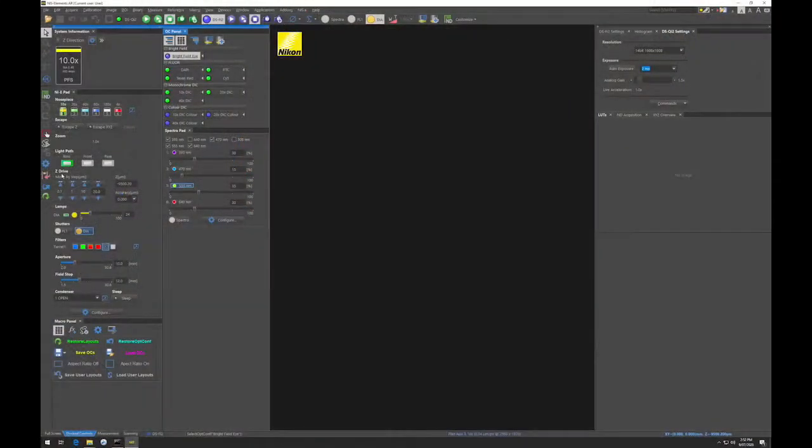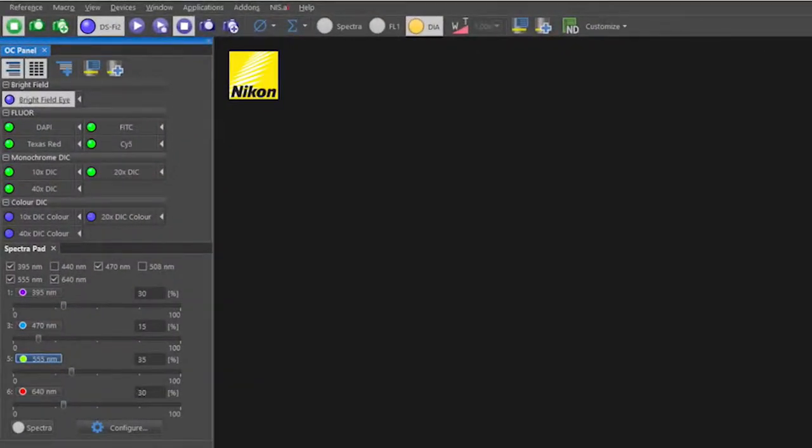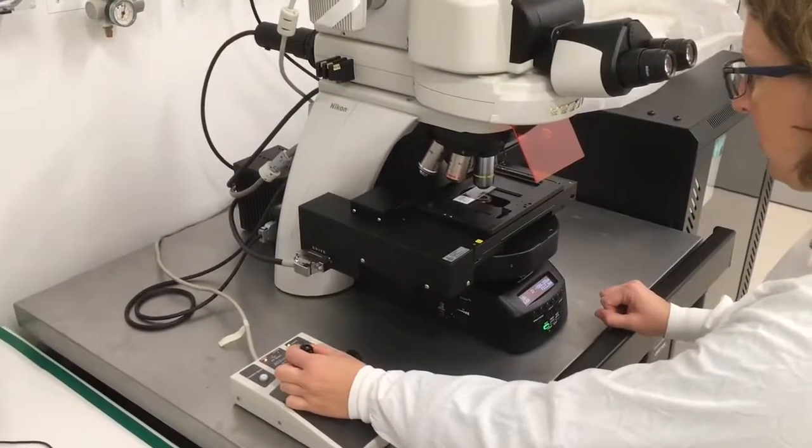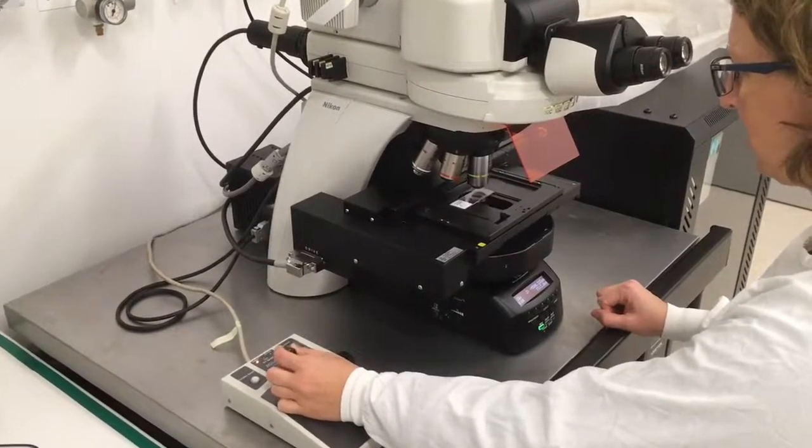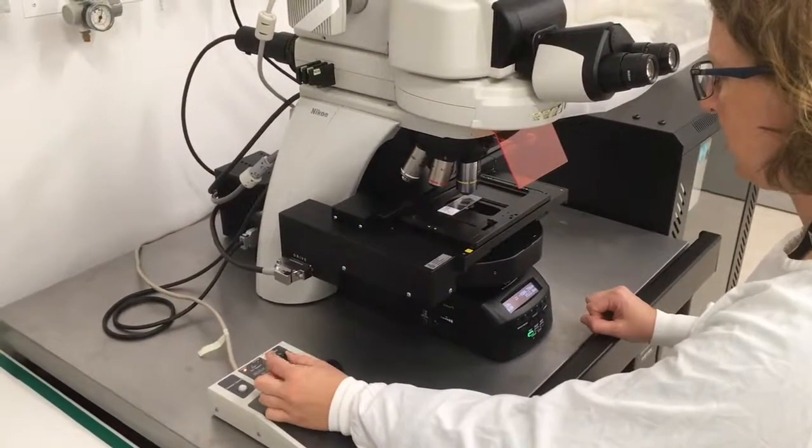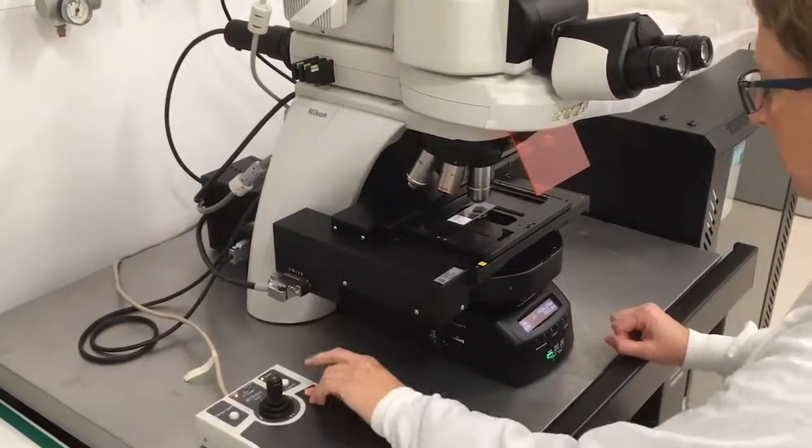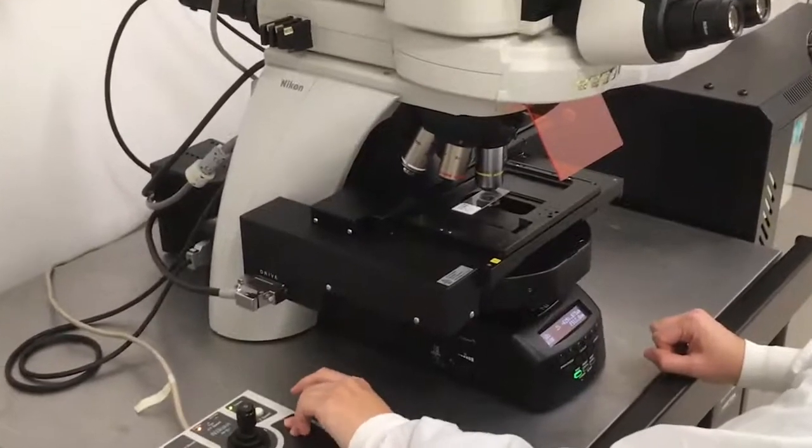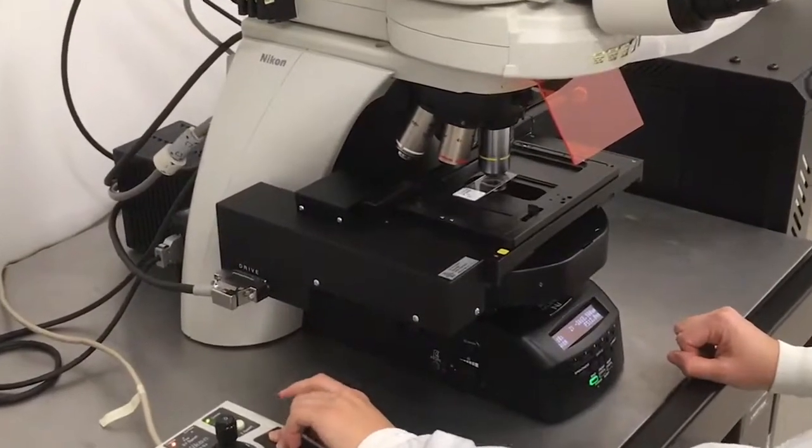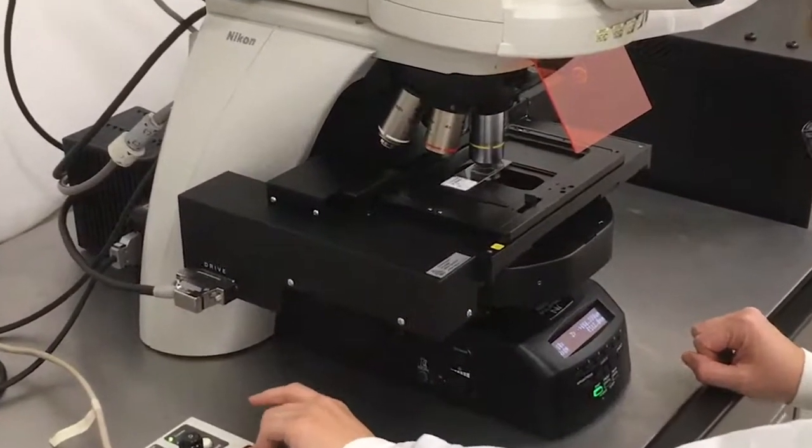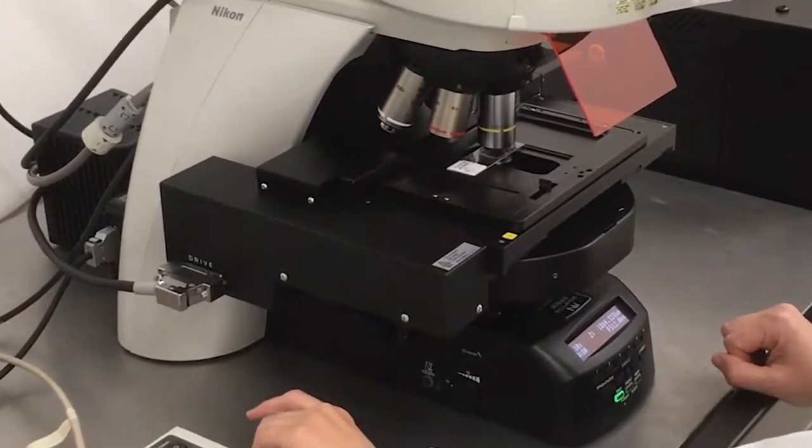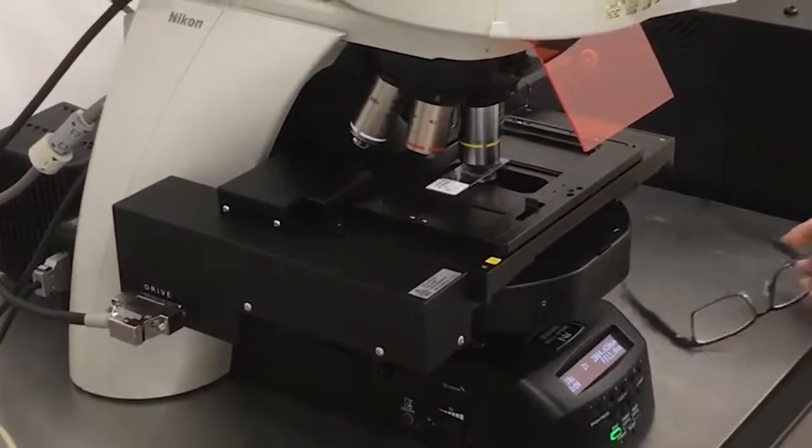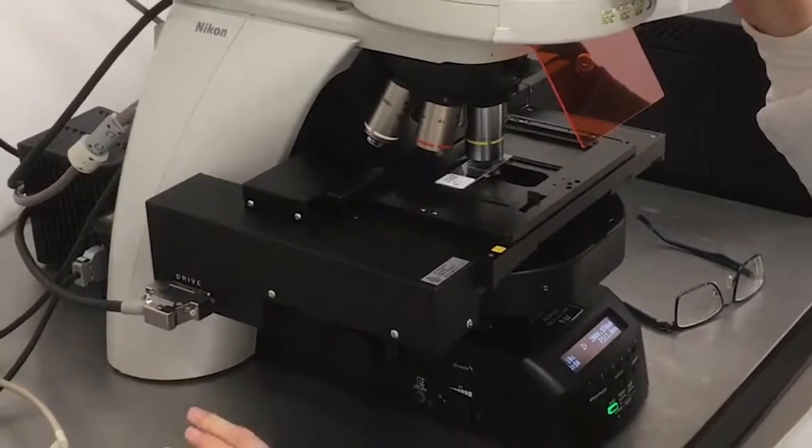Once your sample is on the stage, focus on the sample using Brightfield. To do this, choose the Brightfield IOC. Then use the joystick to move the sample all the way up to the top of the stage range. The 4x and 10x objectives have a large enough working distance that the top of the stage range will not crash into the objective and break the slide. This is not true of the other lenses and the reason why we start with 4x or 10x.